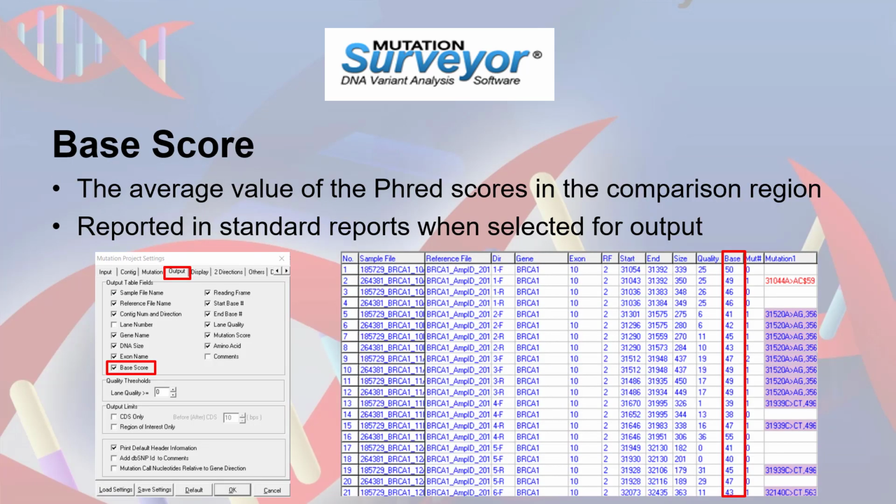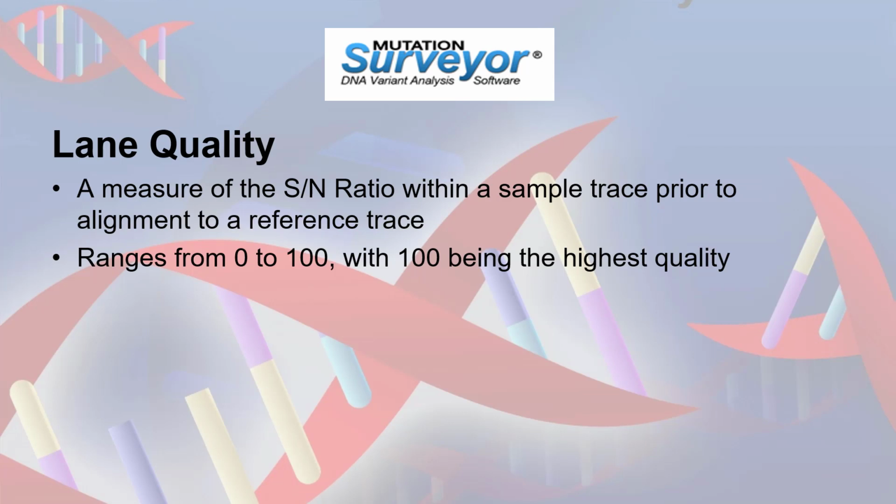The base score measures the quality of the comparison region for a sample. The base score displays the average of the Phred scores for the bases within the comparison region and can be included in the output of all standard reports when selected for display using the Output tab of the Mutation Project settings. The lane quality is similar to the base score in that this quality score provides information regarding trace quality.